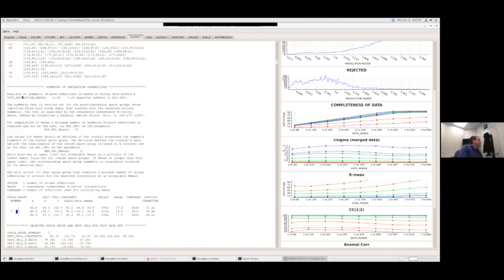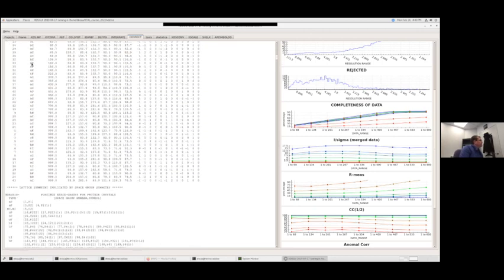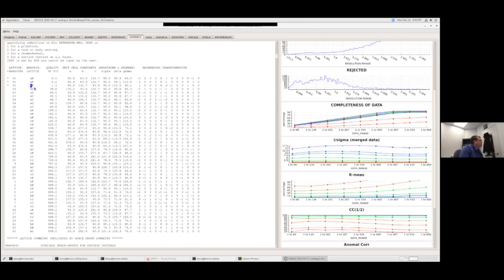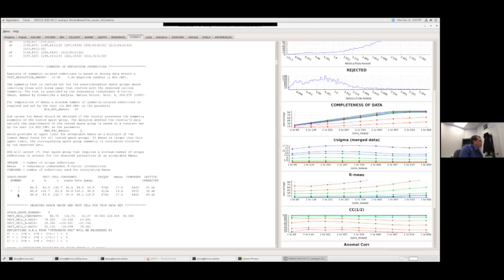So in this case, we picked a Bravais lattice that was primitive monoclinic, okay? So therefore, we only have a few space groups to check. So in our space group table here, space group number 1 would be a triclinic space group, and 3 is the monoclinic, primitive monoclinic space group. And here, what you're looking at is the R measured value.